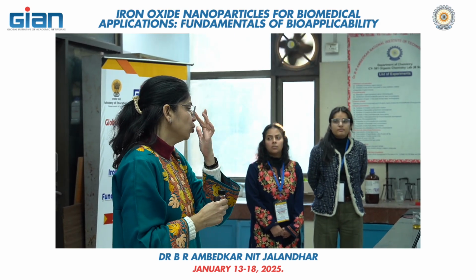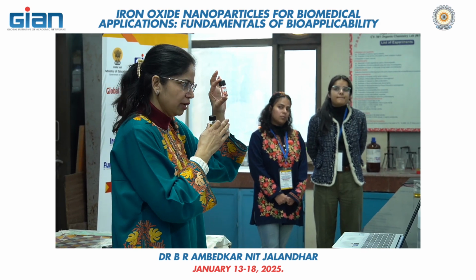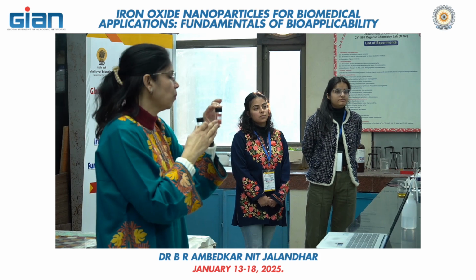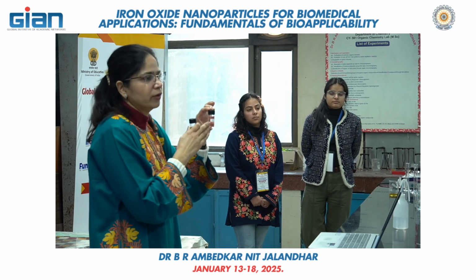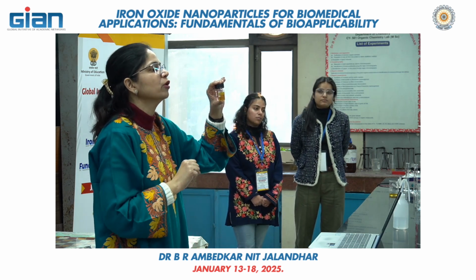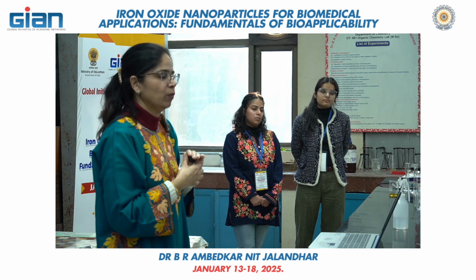So day after tomorrow, when you have the 5th tutorial, you will use these nanoparticles for the separation of these nanoparticles from the aqueous layer, right, from the aqueous solution by using the iron oxide nanoparticles. So here the silver and the gold nanoparticles, they will act as a pollutant, or you can say the heavy metal in water. So you can clear the water. Similarly, here in future experiments, you can purify the water, remove the contaminants from the water with the use of nanoparticles, iron oxide, surface active iron oxide nanoparticles.